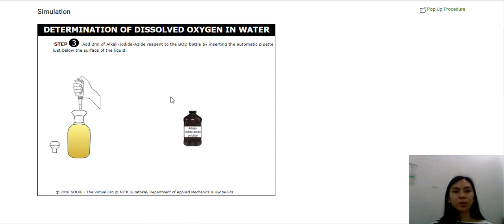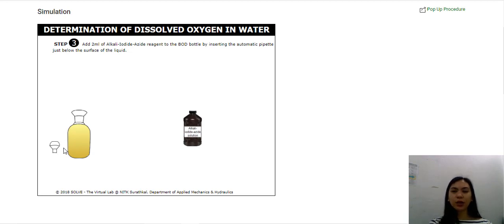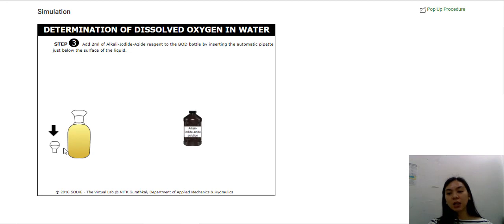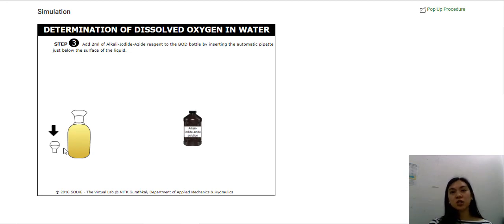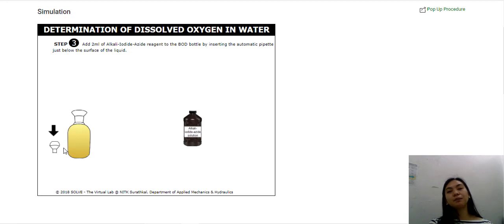Care should be taken to avoid bubbles in the BOD bottle. It's very important that whenever you are handling your sample, there should be no bubbles, because one of the things that introduces oxygen to your water is when it is running in rivers and the like. If your sample is bubbling, you are introducing oxygen into the sample, and the dissolved oxygen you calculate will no longer be accurate. So it's very important that you do not introduce oxygen to the water sample — prevent the bubbles from happening. Be careful whenever you add reagents to the water sample.